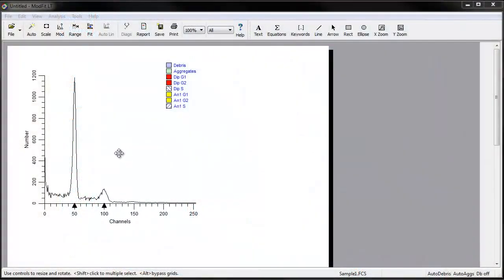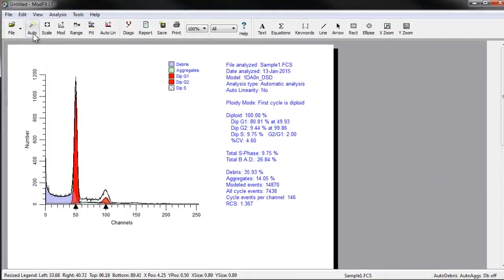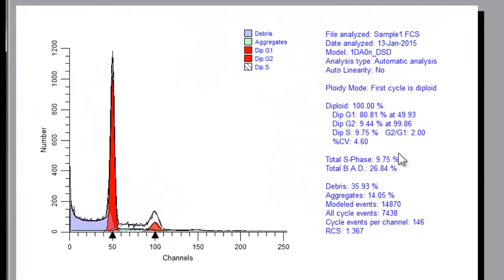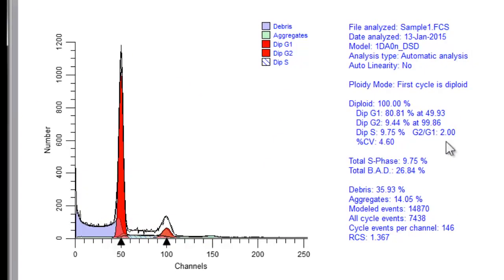We'll start with a typical DNA histogram, one of the sample files, and do an auto-analysis. Note that the G2/G1 ratio is reported as 2.00, the program's default linearity value.